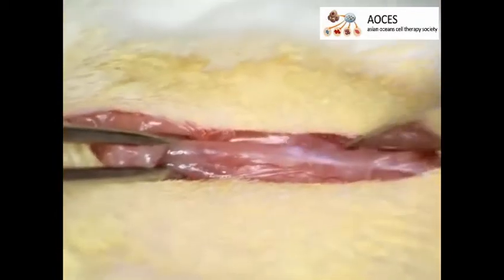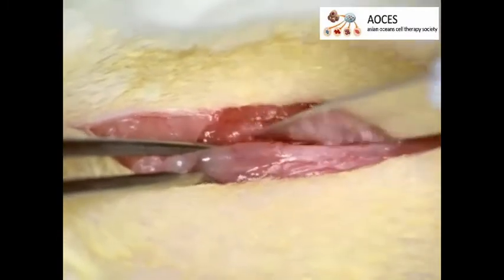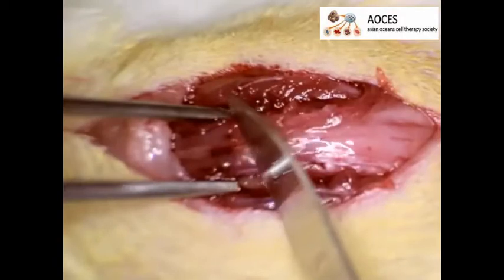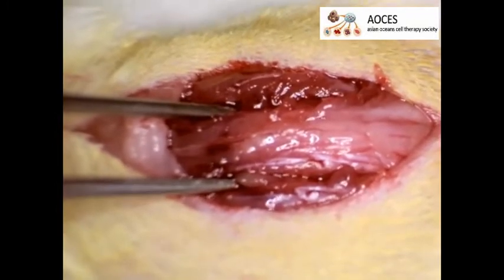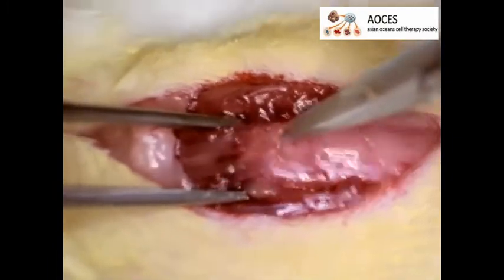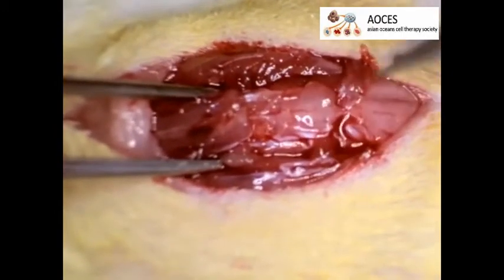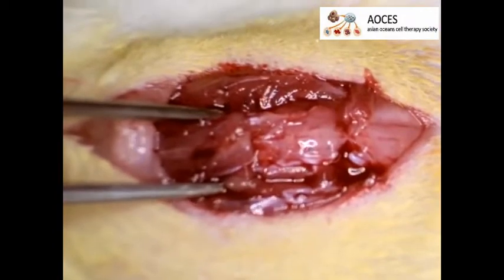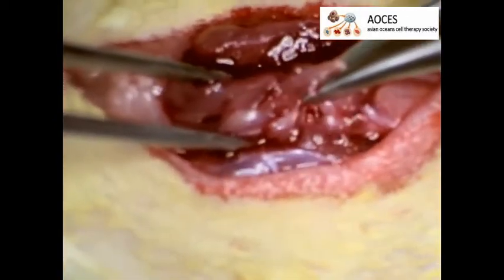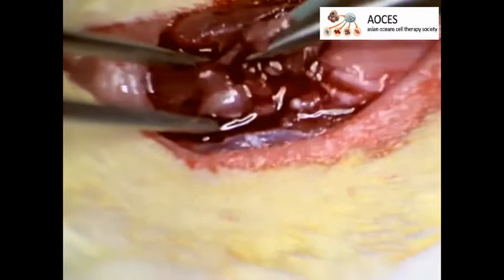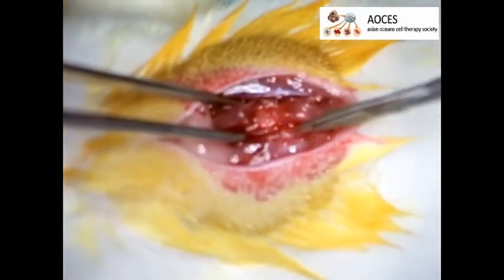Next, use a scalpel to cut the paravertebral muscles bilaterally from T7 to T10 at the vertebral level until the dorsal surface of the lamina contacts the scalpel tip. Stop in the space between the T8 and T9 tiny protrusions. Then use micro scissors to cut the tissue between T8 and T9 and T9 and T10. Now, use the rongeur to remove the T9 process. Expose the junction by using micro scissors to carefully scrape away the muscle layer. Continue until the bone is exposed.